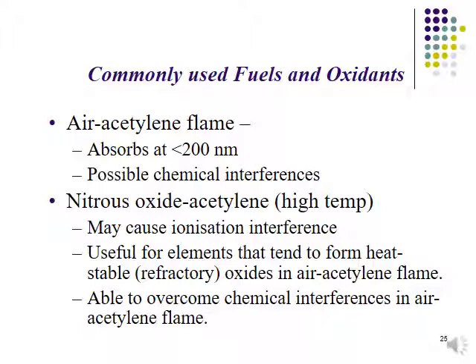So if your analytes tend to form heat stable oxides, you can use this kind of combination of fuel and oxidants. It is able to overcome chemical interference in the air acetylene flame. So when we have a high temperature, we can avoid what we call chemical interference.